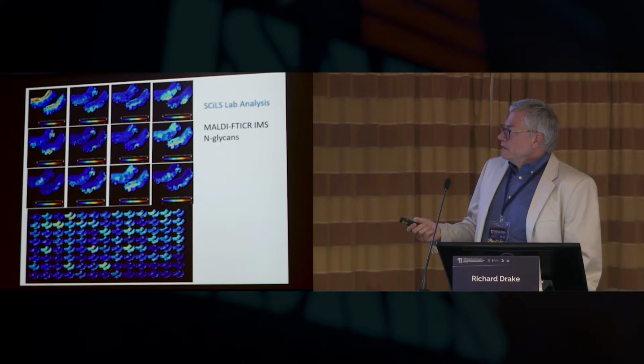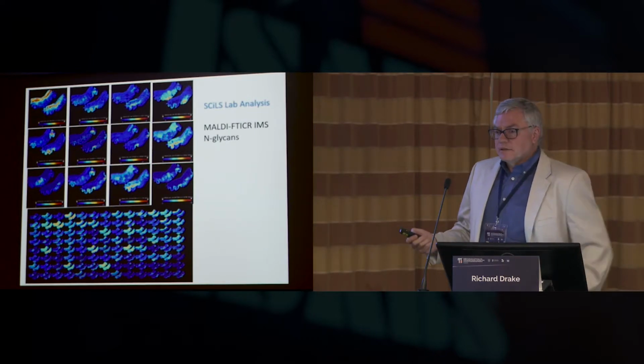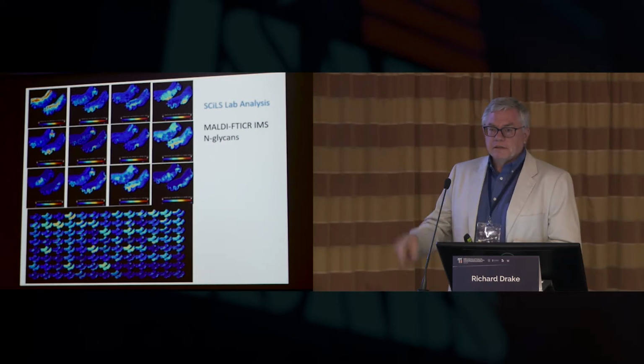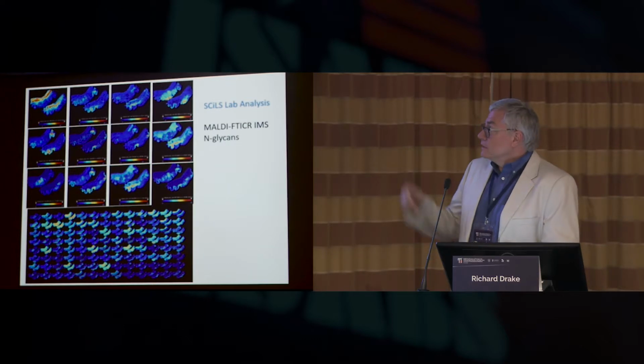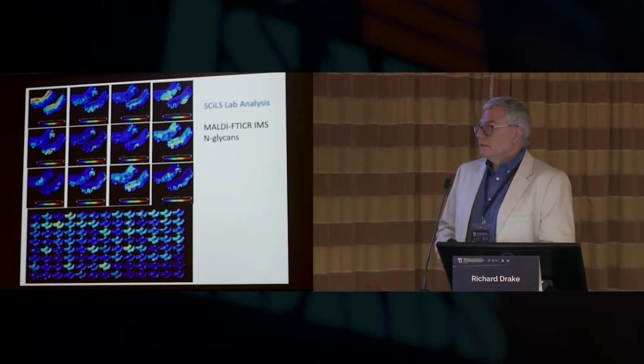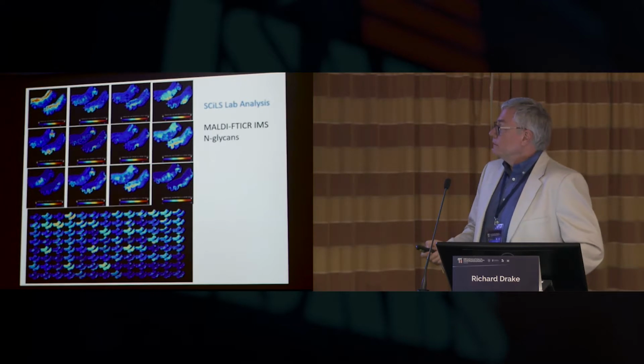Bruker has been quite helpful. We've got a lot of software. This is literally push button now. We can generate the spectra. You find a peak, you press the button, you can generate this image. You can export this into the SCiLS Lab analysis software, and now extract out all the intensity data and start doing a lot of stats and comparisons that way.